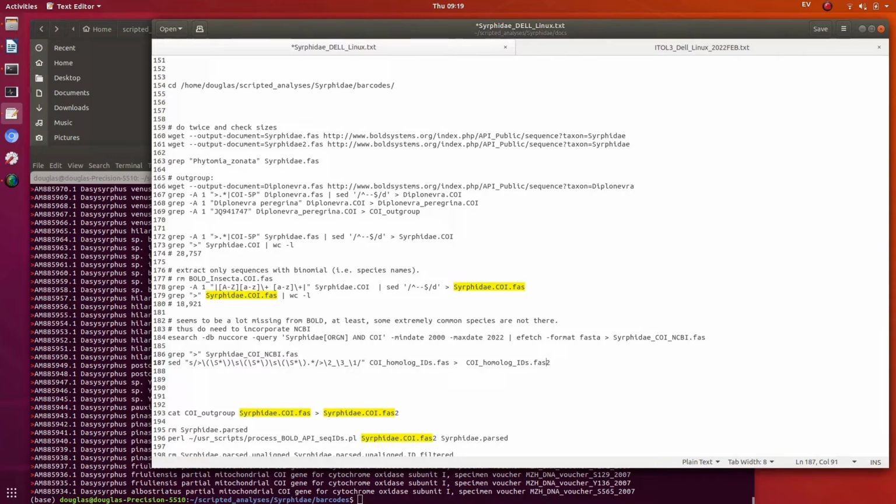So let's insert the file name we're working on now. You can see the file we have has accession, genus, species, and a bunch of other stuff. And the sed command is searching for the first word, well, first string, which is not a space.